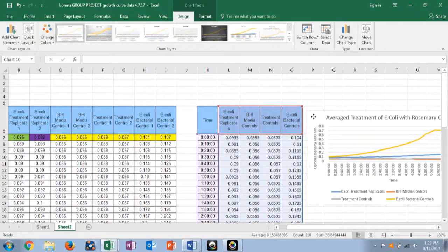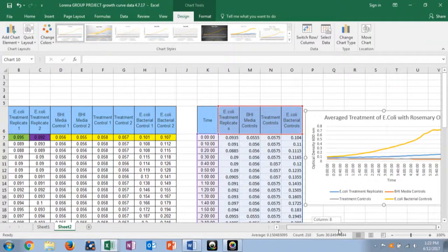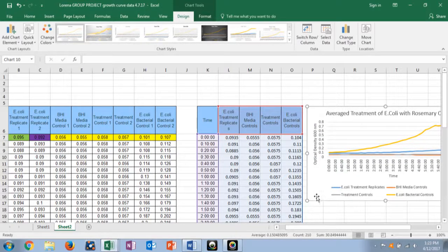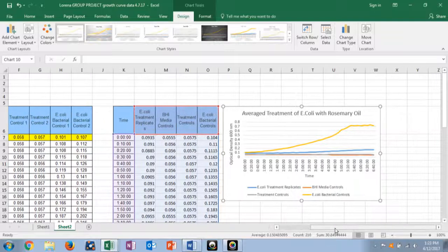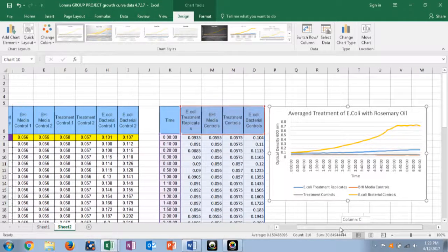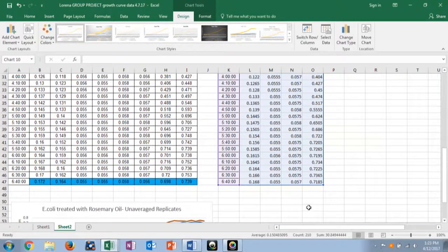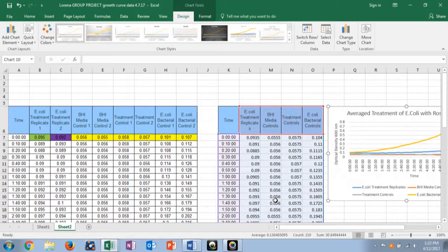But for now, this is going to be this video, and I will figure out how to upload this. And hopefully this answers a few questions about how to deal with this data. You can do this for each of yours. I would only put the ones that worked on your poster, and for the ones that didn't work, I would put that they didn't work, and I would put the starting and ending optical densities on your poster in chart form. I would also calculate the growth rate.